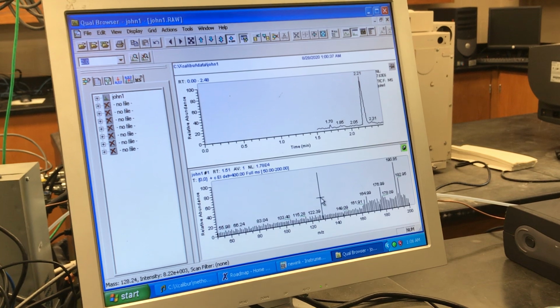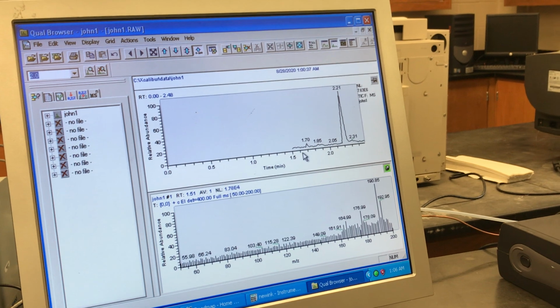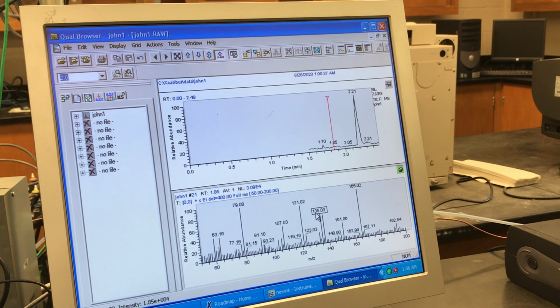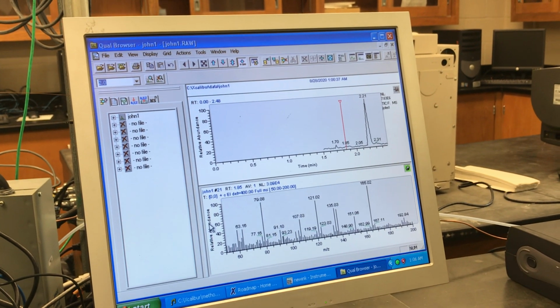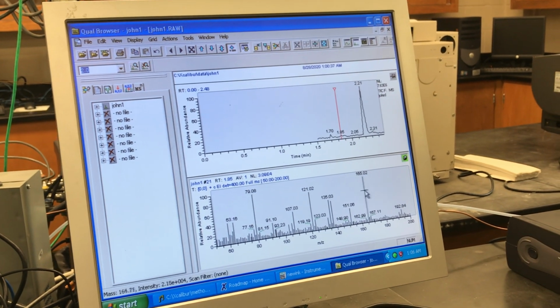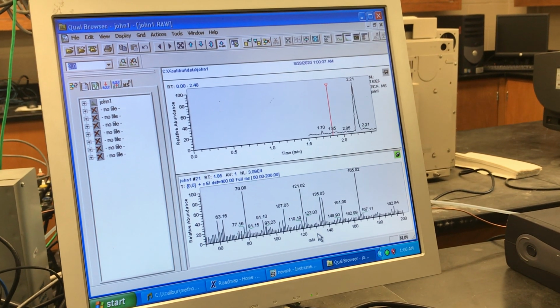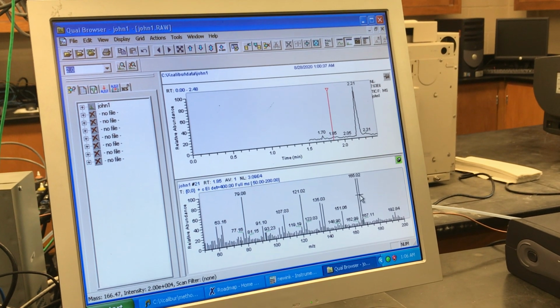Now, what am I looking at in the bottom panel? Well, in the bottom panel, that's going to be the mass spectrum that we're going to see as a function of where we are in the chromatogram. So for example, I can click anywhere I want on the total ion chromatogram and notice that what I'll generate down here in this panel is a mass spectrum, which is a relative abundance. So in other words, this is going to be essentially an ion count as a function of mass to charge ratio. So we can see that we have various peaks here that correspond to specific ions that I'm generating at specific mass to charge ratios. Okay, so this is basically an ion that I'm getting at about 165 AMUs.